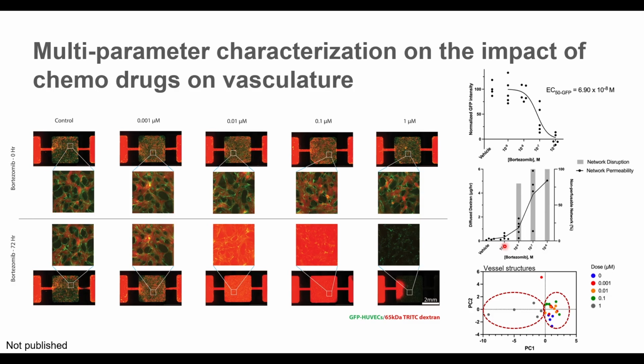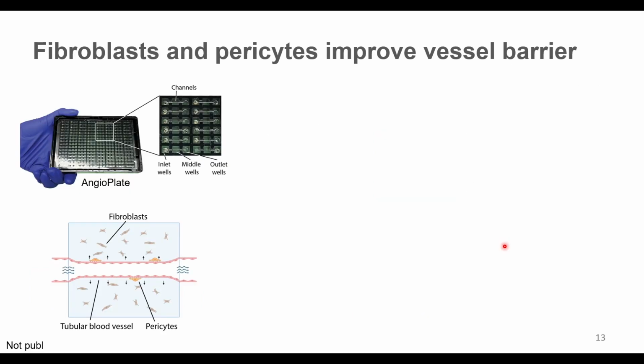Now, there are some limitations with this kind of self-assembled vascular model. One is that there is structural variation from well to well. That's something that's a little bit difficult to control. But if you care about this structural remodeling with your drug treatment, then this is the model you should definitely consider. But if that's not something you care about, then we can actually further simplify these blood vessel models to turn them into a single tubular vessel, so even simpler structures, right?